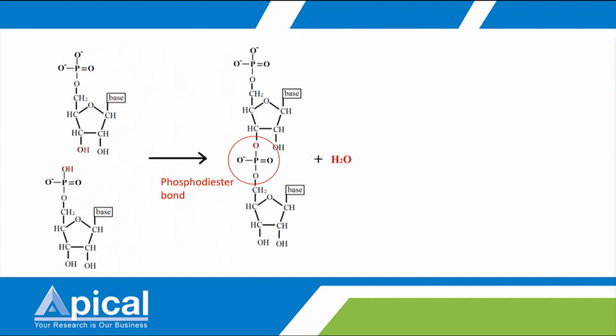So it means the insert needs to have this 5 prime phosphate to facilitate the ligation, or else if your insert doesn't have the 5 prime phosphate, then ligation cannot happen. Okay, so do take note of this. And also 2 points to remember.